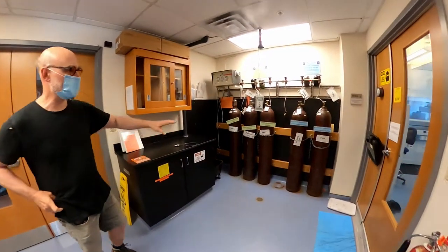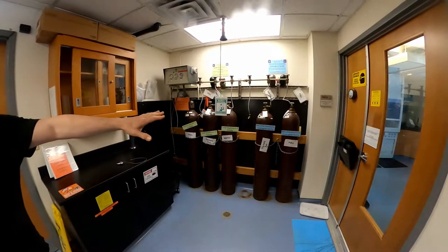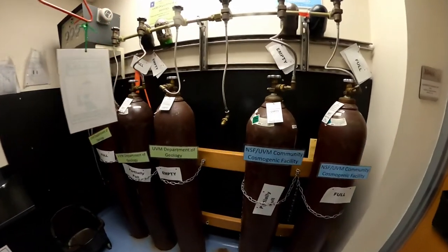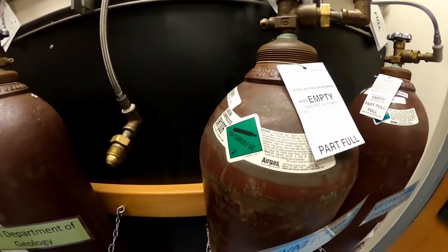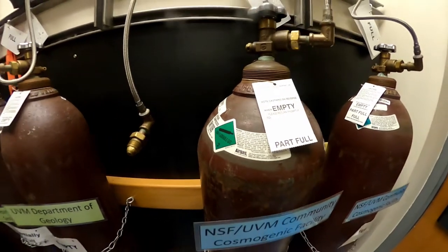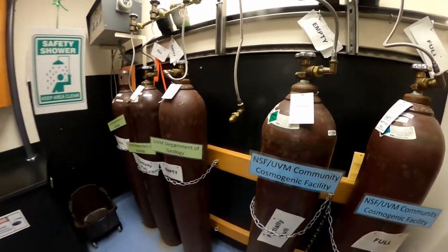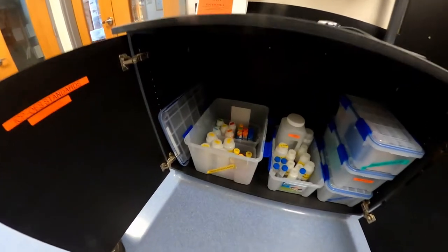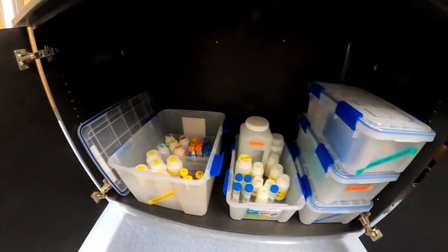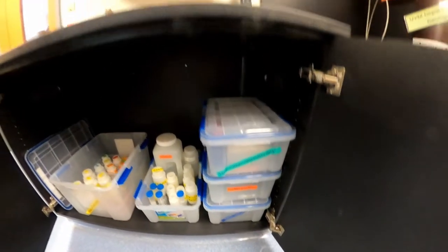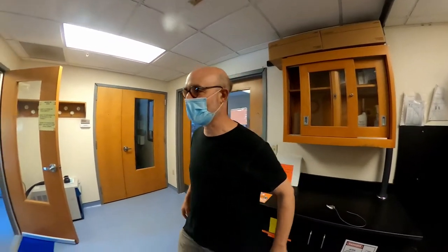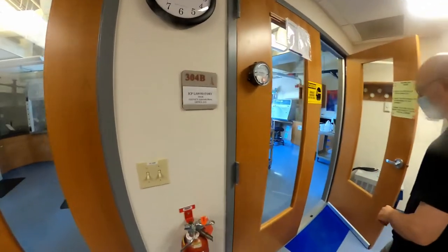So this is our ICP laboratory vestibule. We have two tanks of argon gas here. And that's what we use to make that plasma is this argon gas. And we get about 12 hours of runtime off one of those tanks of gas here. We have all our standards for the machine down here. This is a vented cabinet. So any acid fumes that come off these go up that chimney pipe and we don't want to breathe them, which keeps us safe. And Nico and I are wearing our personal protective gear today because we're within six feet of each other. So we're trying to be safe. This is our ICP lab.